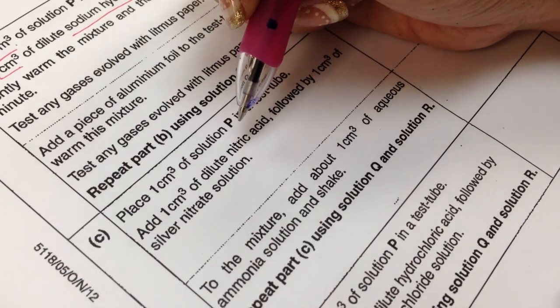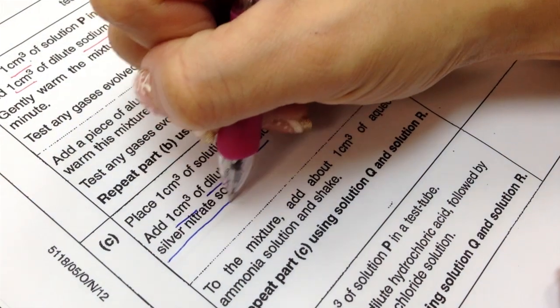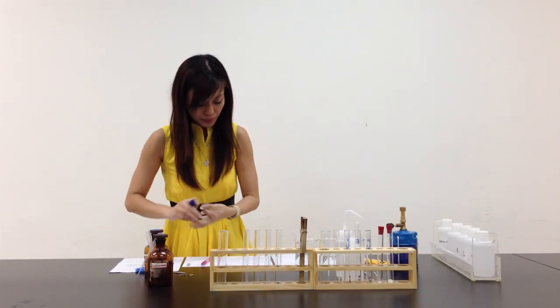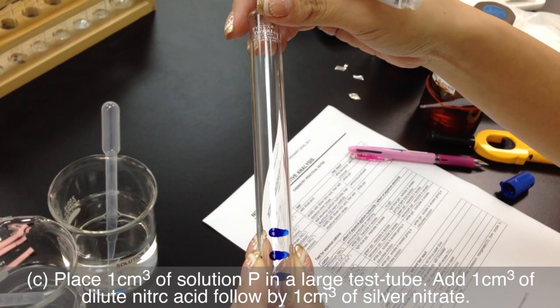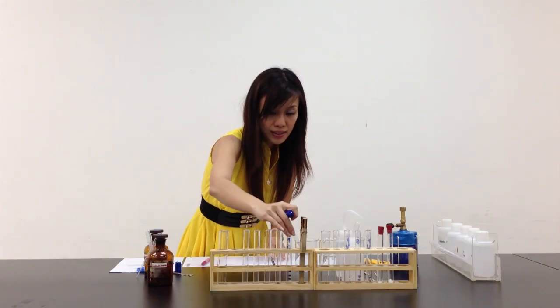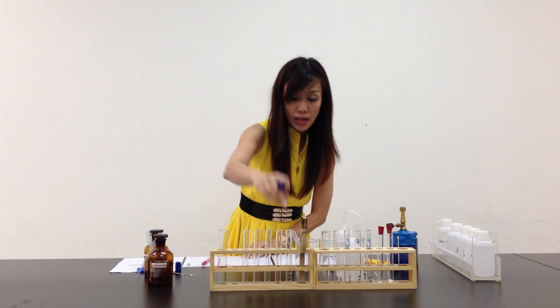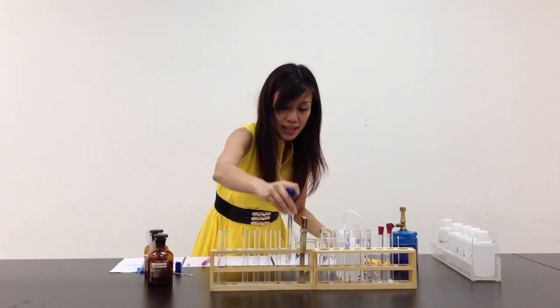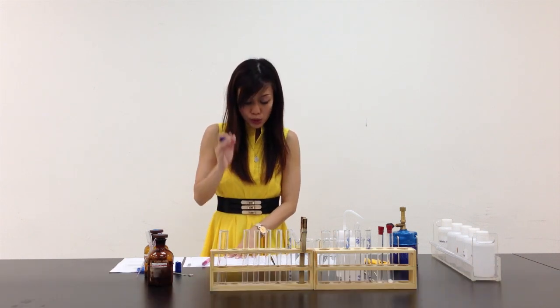Let's move on to Part C. Place 1 cm³ of solution P in a test tube and add 1 cm³ of dilute nitric acid, followed by 1 cm³ of silver nitrate solution. Then to the mixture add about 1 cm³ of aqueous ammonia solution and shake — so that's 4 markings. I'll write P, Part C. Repeat C using solution Q and solution R, so all the markings have to be done for both Q and R as well.